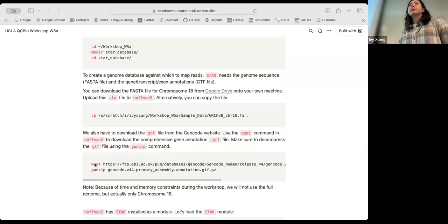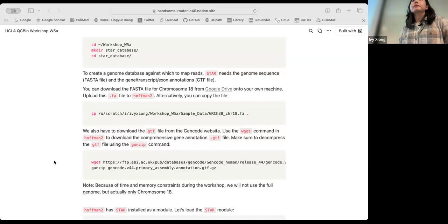Those are two different commands: one is just download, like getting it from the web. After it's on our computer, then we unzip it. Download might take a couple minutes, and it should give you a progress bar. It's very handy to have updates.